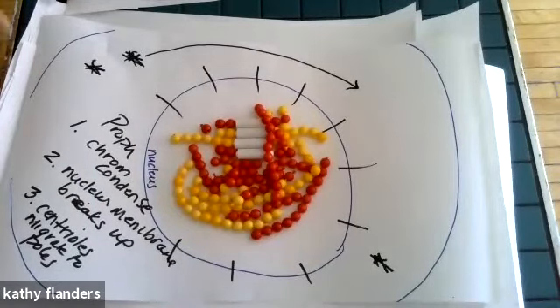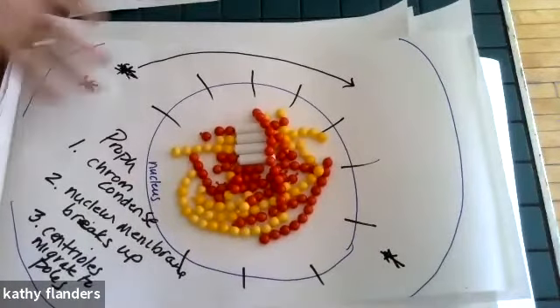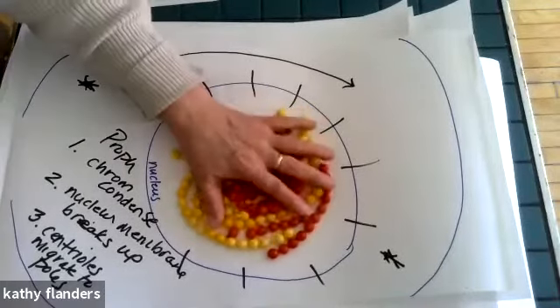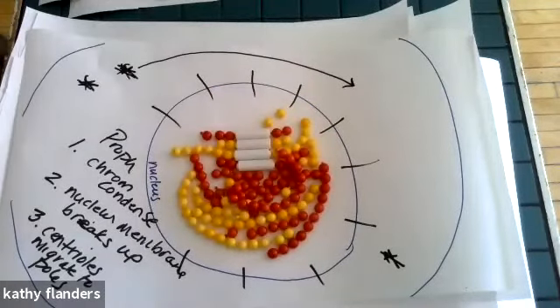That's kind of the yarn-like. And I am going through interphase, but this time I am a cell in the testes, in the seminiferous tubules. Okay, seminiferous tubules.